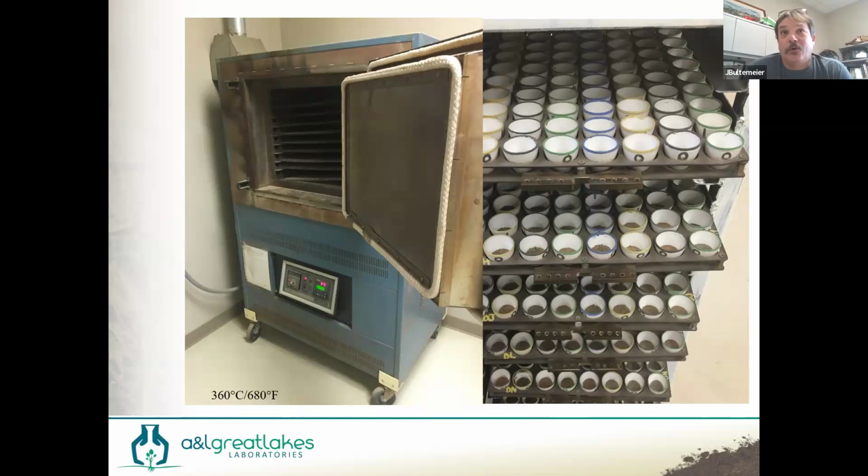We're going to burn or ash off anything that's volatile or can burn and leave the mineral fraction behind, and we'll weigh that. The thing to keep in mind is that's a percent by weight. Organic matter is about 5 times lighter than mineral soil. So 1% organic matter is actually quite a large amount when you think about it on a weight basis.